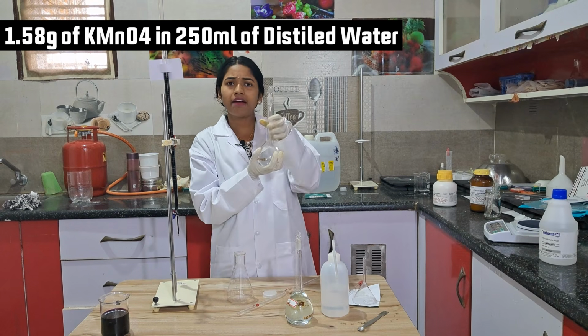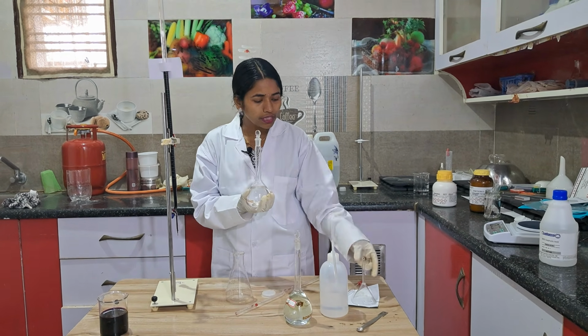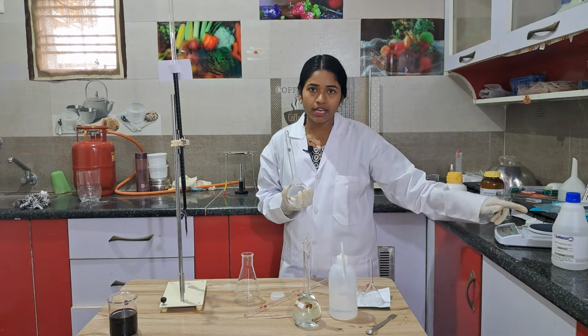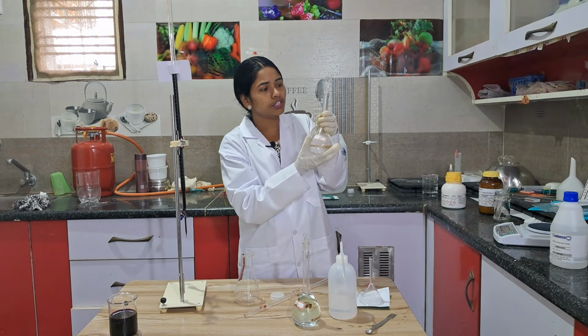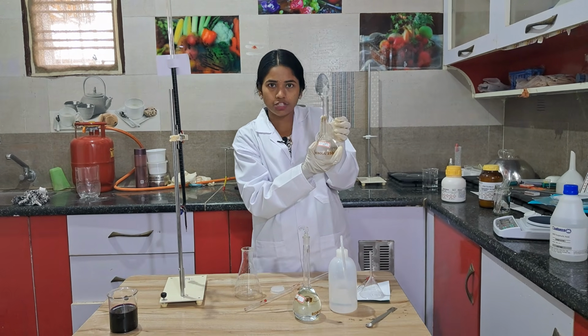In the same way, I took one measuring flask, kept the funnel here, weighed 1.58 grams on the weighing machine using a paper, and transferred it into this.